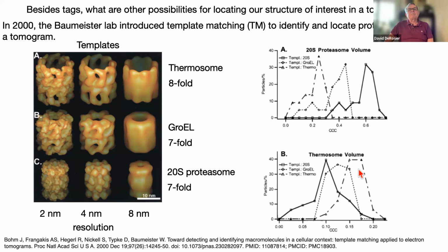So he showed you could pick out and differentiate different kinds of particles, even though in some sense they look very similar. So this was a proof of concept.